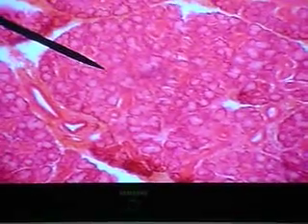So we go back to it and see that the glands are lobulated. And as you know from your first term's work, a salivary gland is just like a bunch of grapes, where each grape is an acinus. Okay, and that acinus may be either serous or mucus.